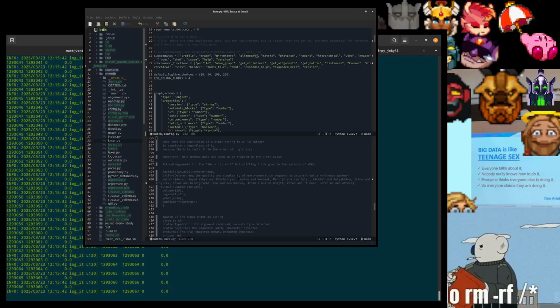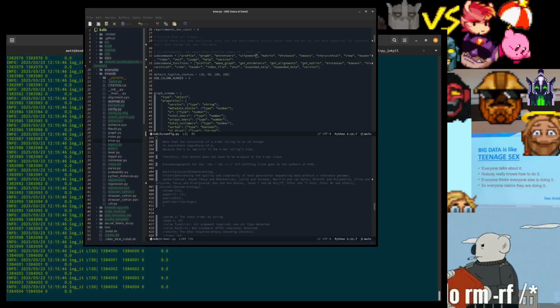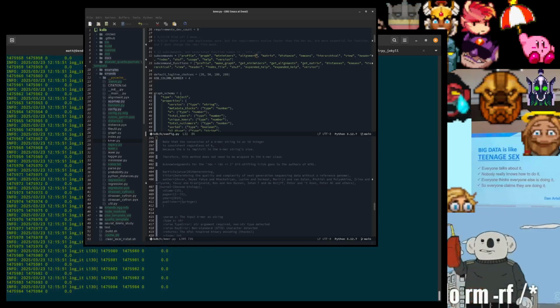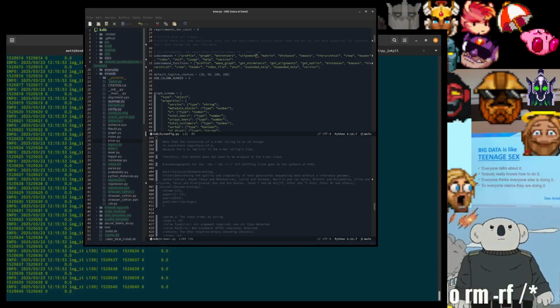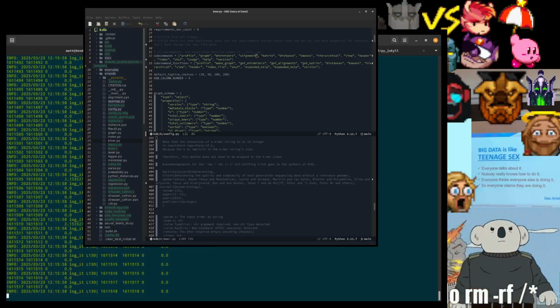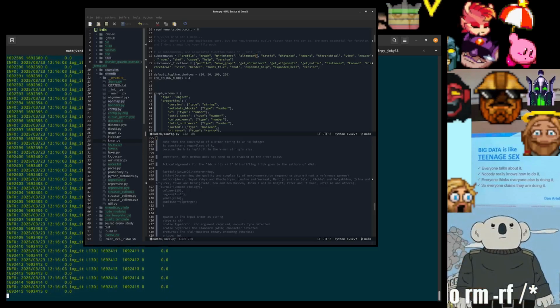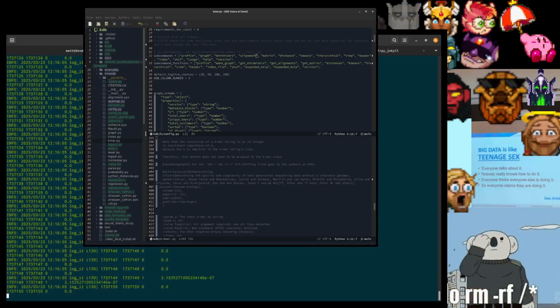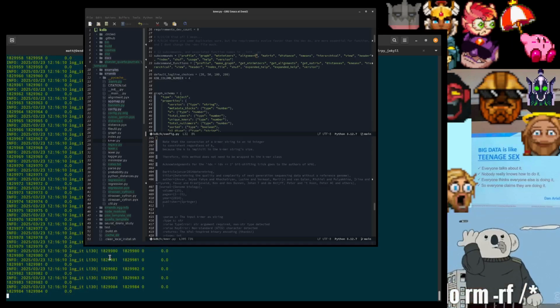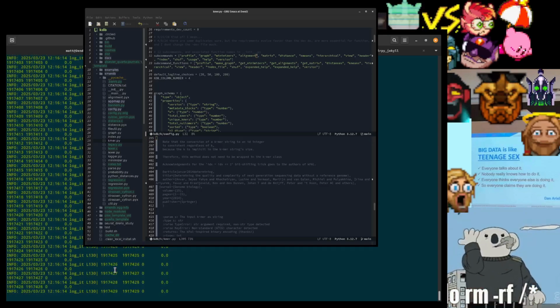And there's a sort feature that will allow you to sort by the most abundant kmers if need be. If you really need me to put that in here, you know, it is. But essentially, this is a tabular format. You can do all of this in Excel or the command line. You can sort based on the kmer abundances that you're interested in. And so all these numbers that are incrementing, those are kmer IDs and row numbers.